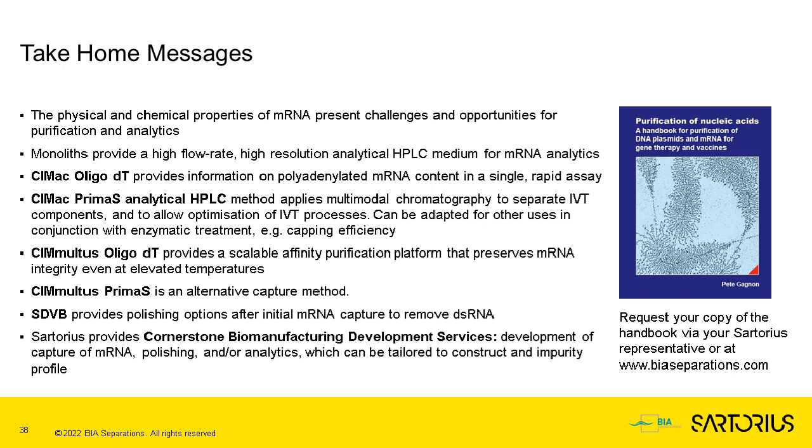I think we have time for a couple more questions from the audience. Do you recommend monitoring the IVT reaction of a production run that has gone through process development to optimize the IVT reaction? Is there enough batch-to-batch variability that requires monitoring? And if so, how frequent should monitoring be done in a production batch?